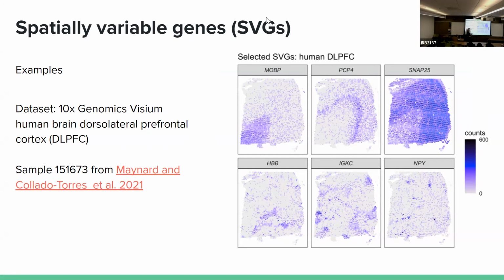And then you could, for example, identify something that's going on at the cellular level. That's how the community is recommending doing this. You first discover with not perfect data, not perfect in the sense that it's not truly subcellular. That's what everybody's beef is with Visium. It's not subcellular. Okay, well, better than not. Yeah. Other questions?